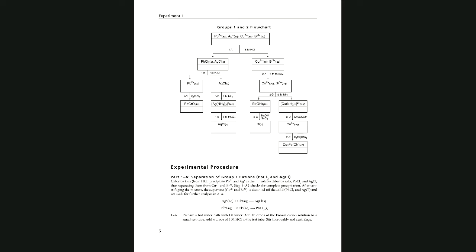Without wasting time, I'm going to start with the unknown procedure for your unknown sample. I'm going to take one unknown and work with it. We have plenty of unknowns. I usually have students pick a letter or pick a number, and then I give them the unknown. But right now I'm just going to pick one and start working with that one unknown. So watch me and identify your unknown.